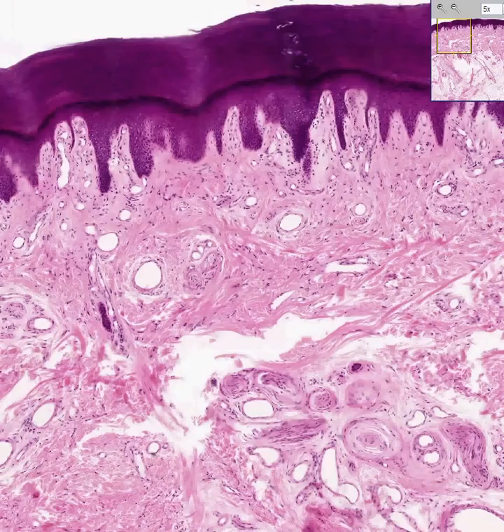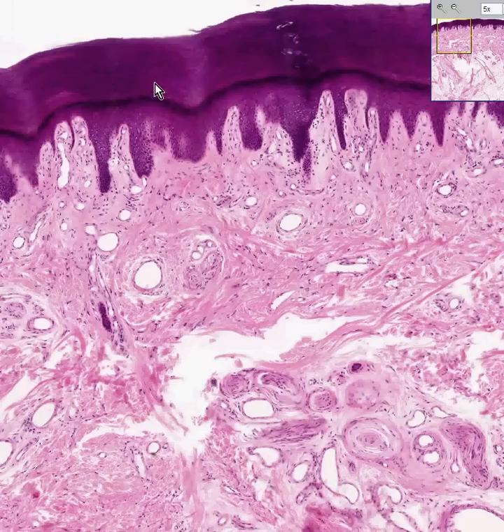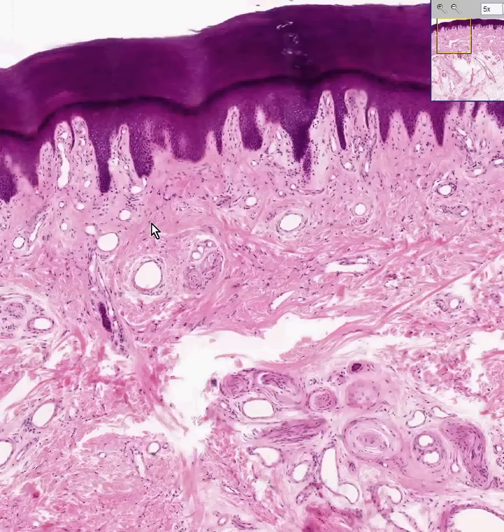Here we have another section of skin. In contrast to the last section of skin that we saw, which was called thin skin, in this section of thick skin we can see that the stratum corneum, which extends all the way from here to here, is considerably thicker than the entire thickness of the rest of the epidermis. That's why it's called thick skin.